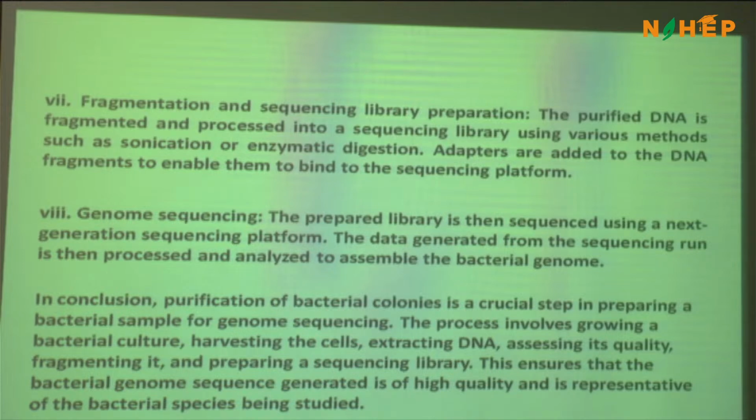Quite easy. Rhizosphere, you have already witnessed that day, right? And this is thoroughly explained in the manual as well. For phyllosphere, there are a variety of techniques. First and foremost technique is extraction by washing. You have to wash the cells from the leaf, right?